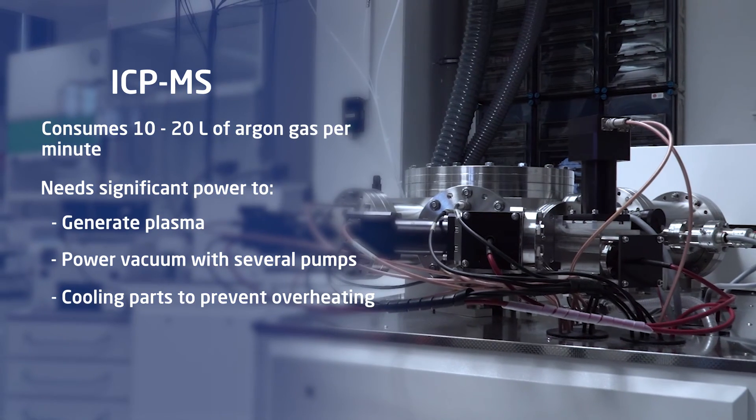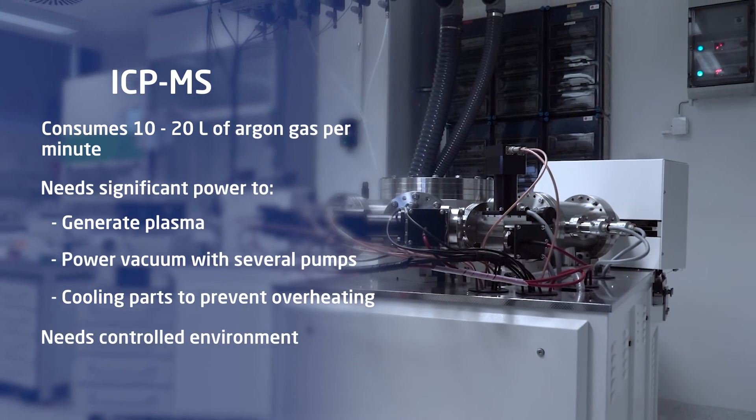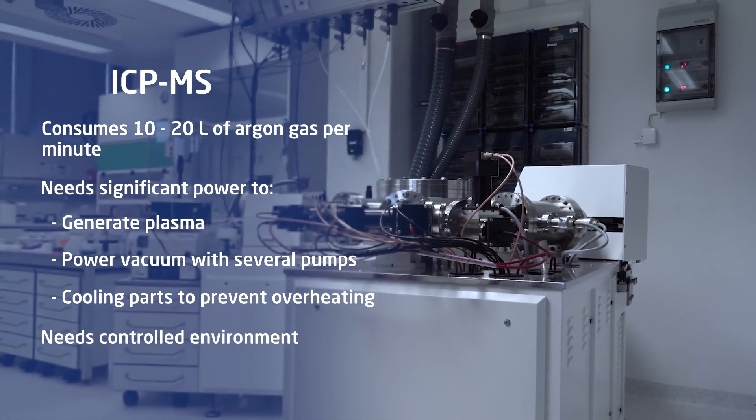In addition, the machines need a controlled environment with a fairly constant temperature and little vibrations.